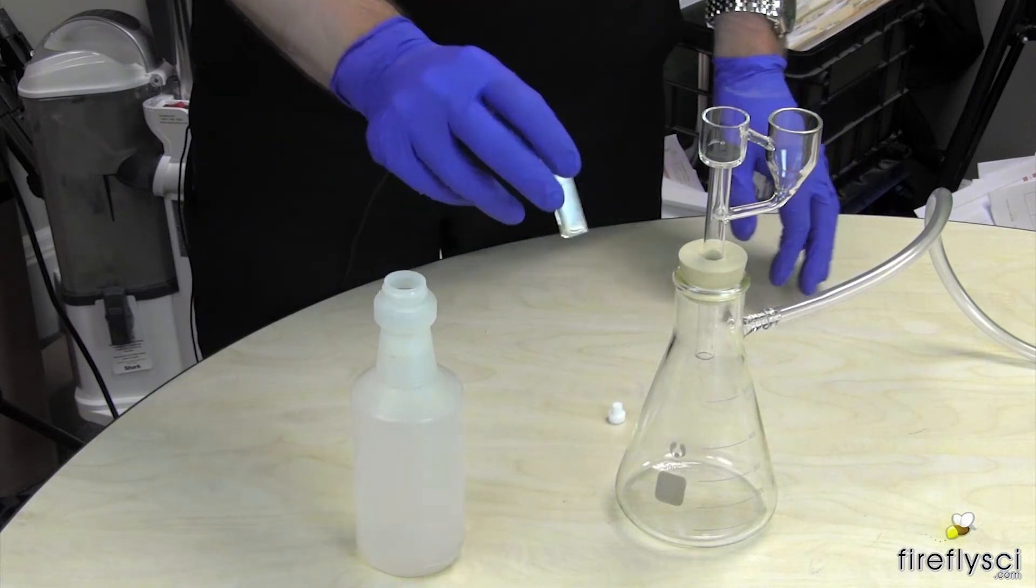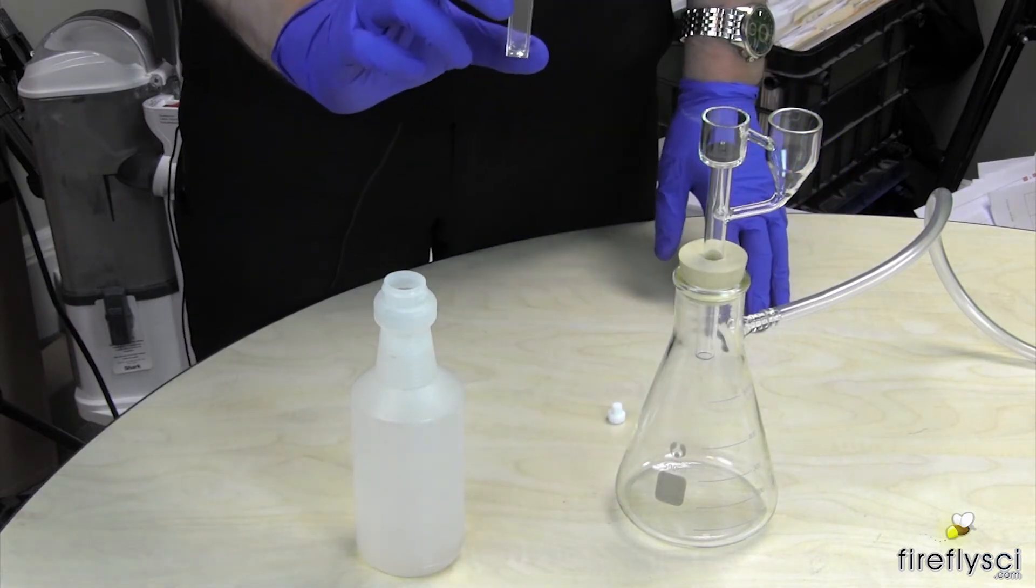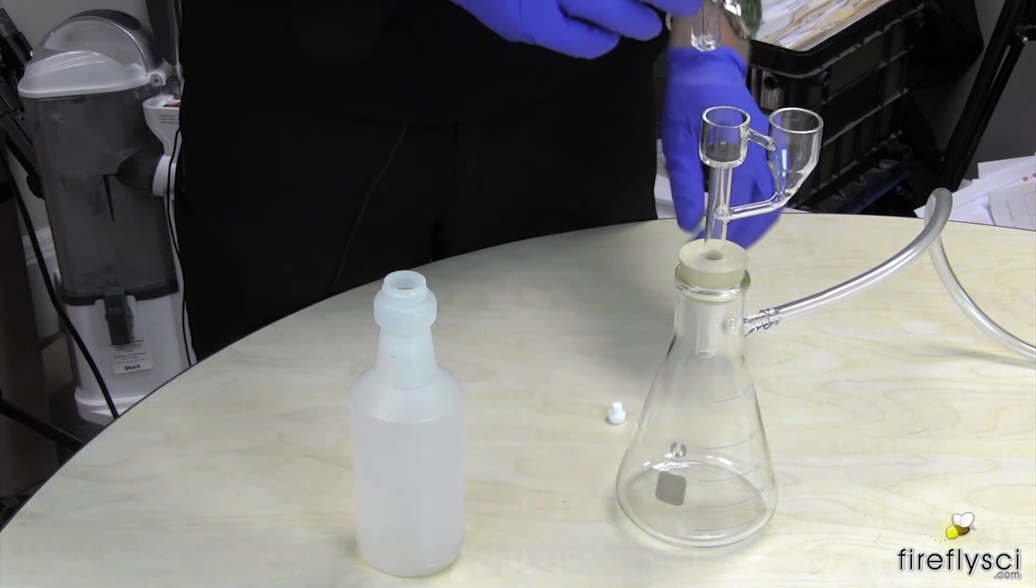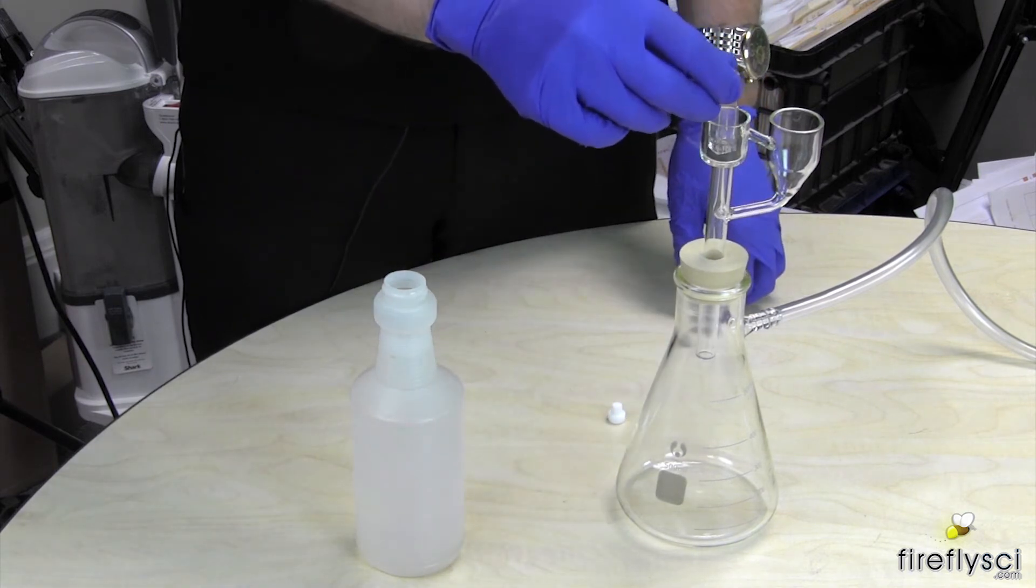Okay, so I got my cuvette here all ready to be washed. So all you have to do is flip the cuvette upside down, put it right on top of the black gasket.